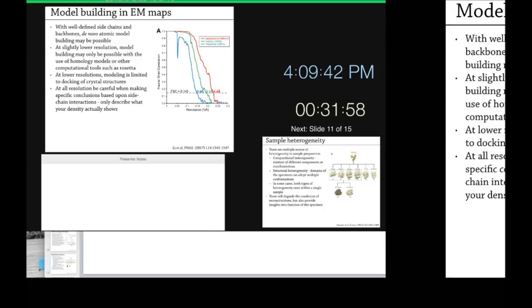Okay, and then this is what happens. You've gone through all of this and you think, yeah, my map's at around 3.2, 3.3, it's really nice, Ed's happy, he thinks I've done a good job. The next thing is to try to go through and evaluate it locally.